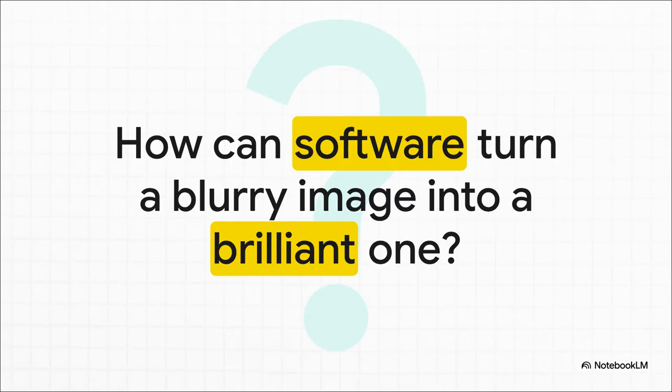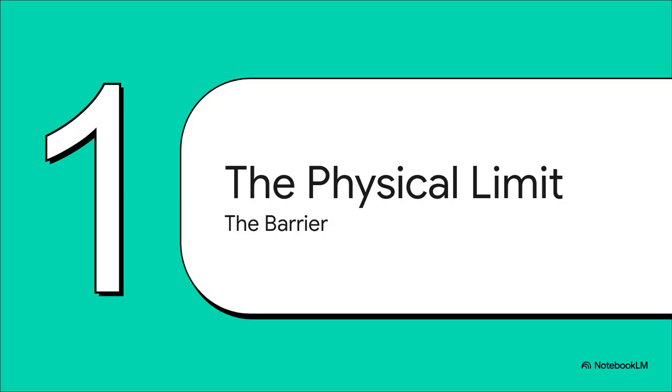So that's the big question we're tackling today. How in the world is this possible? There's no new hardware here, no fancy new microscope involved. This incredible leap in clarity is achieved purely through computation. It feels like a magic trick, but it's absolutely real, and it's completely changing how we see the very building blocks of life.